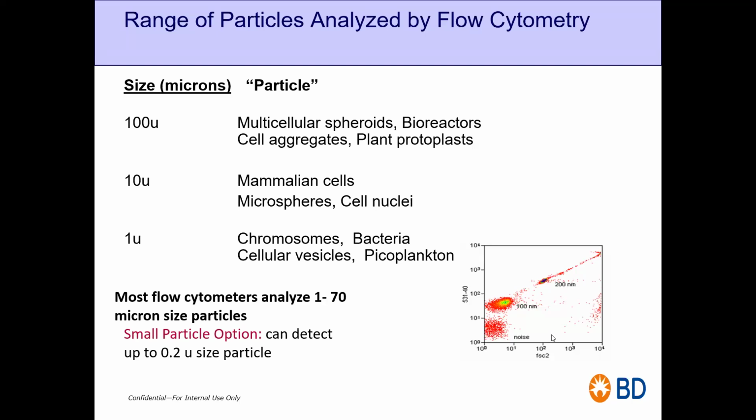In this case, they are using some beads. This method is very useful in exosome studies, and people these days are using it for exosome studies.